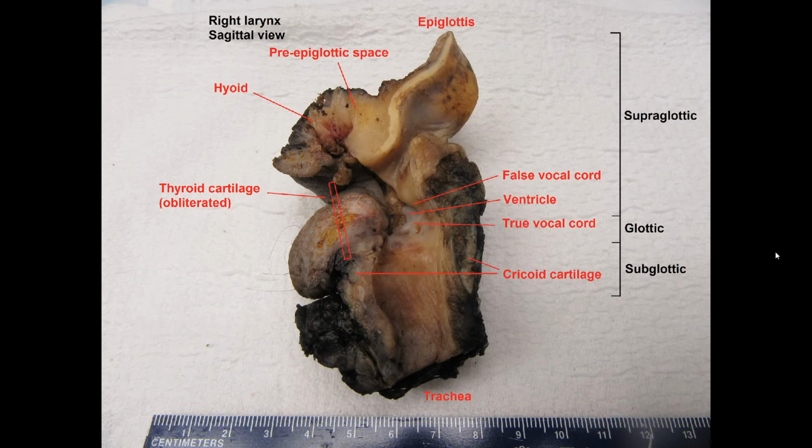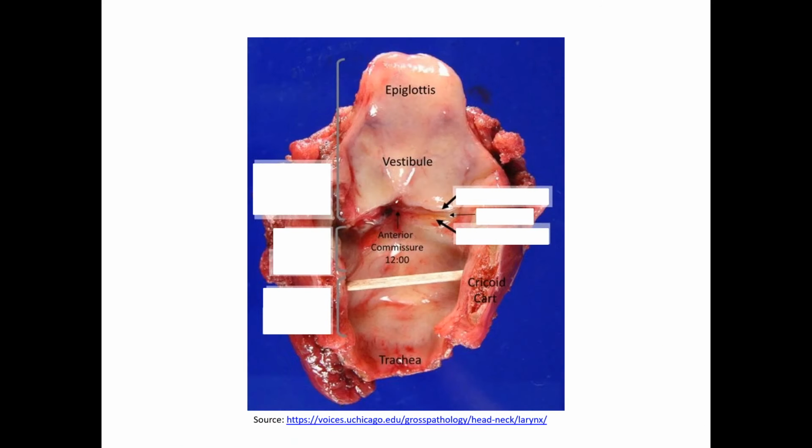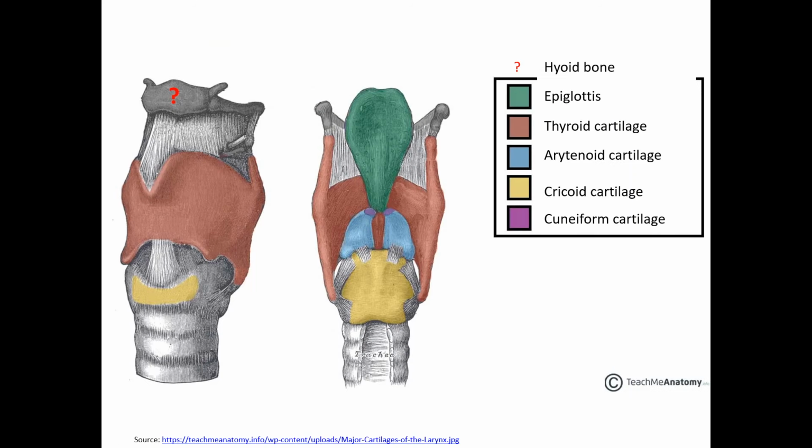And then I sort of modify the sarcoma synoptic to include elements of the larynx anatomy. So at the end when I finally sign it, it ends up becoming a very long report with an almost hybrid view or form of the two synoptics. When it comes to sarcomas in this area, again, it's all about the gross.